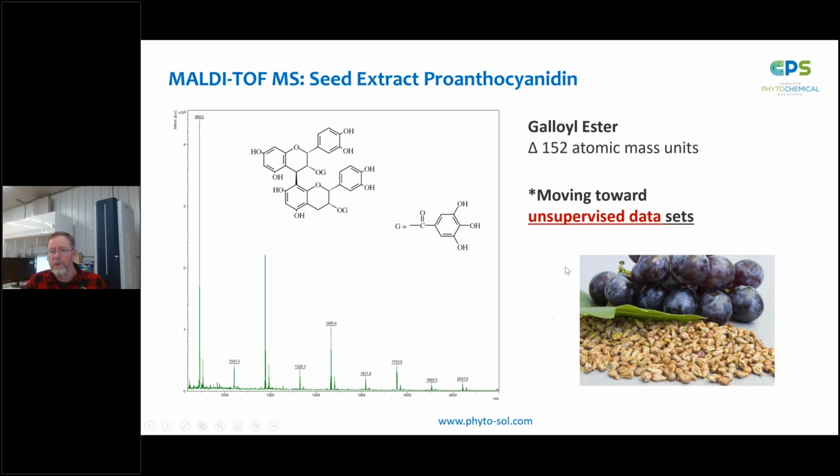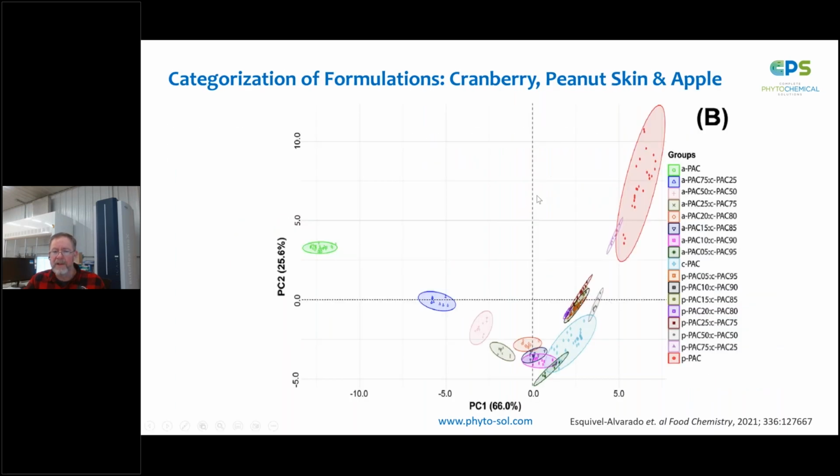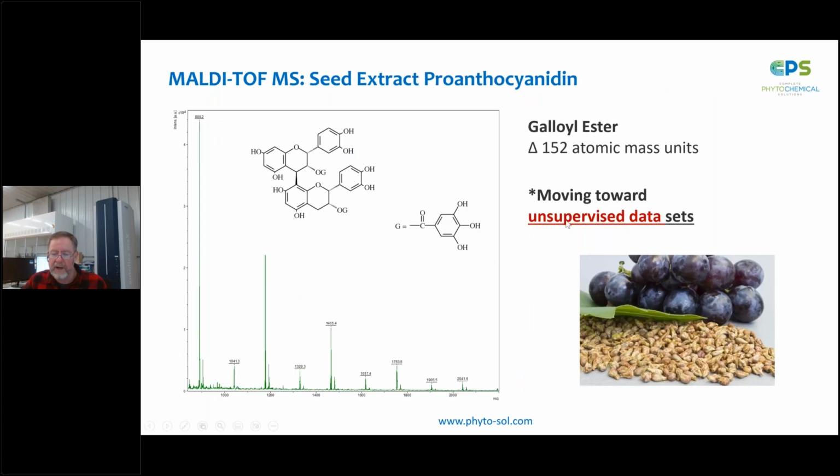If we were to say to the statistical software, let's just call in the XY data, and I'm going to let the software itself determine across this whole diversity what are the most relevant components or the most relevant masses to differentiate, we are now moving toward an unsupervised environment. And this can be a very powerful platform because we're looking at multi-dimensional comparisons. Graphically, when we present this as an image like this, we're only showing two dimensions. We're showing the X and the Y dimensions. But in statistical packages, you can have higher level dimensions that aren't capable of being captured graphically. And that's really the power of an unsupervised approach.